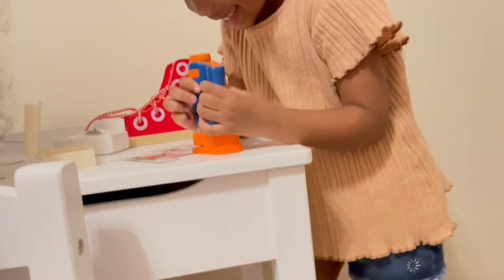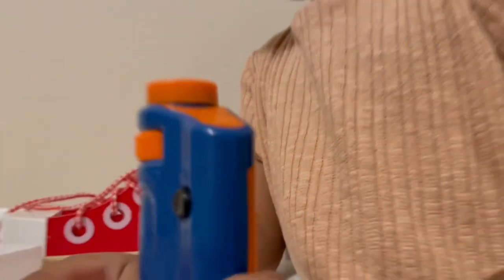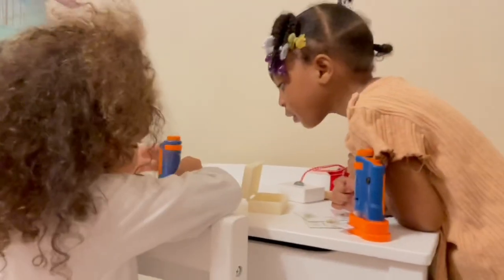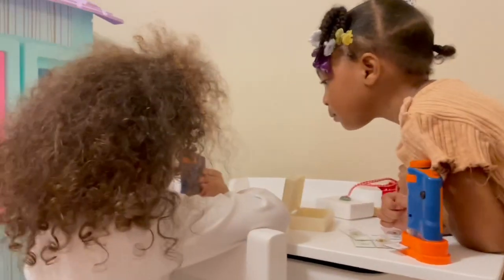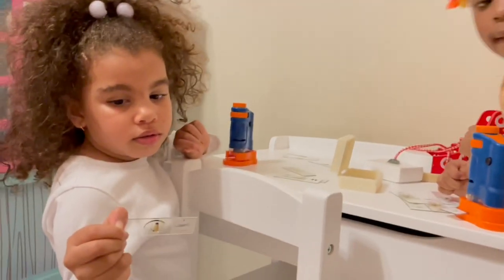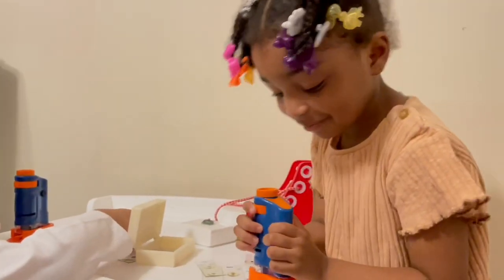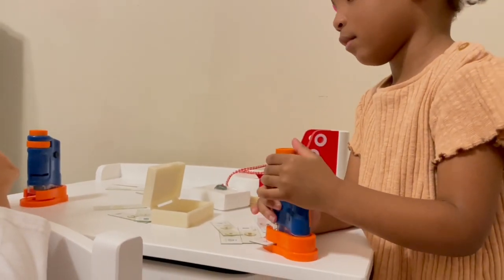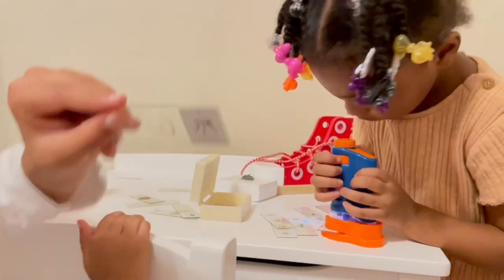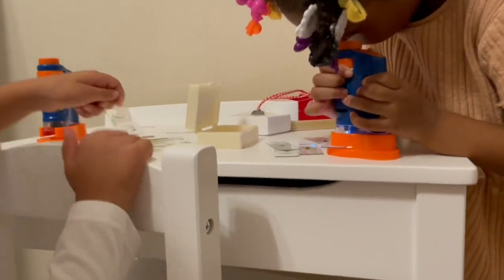London, what do you see? What are you looking at? It's a housefly mouth part. Look at mine. This is the bug's leg, right? Yeah. But the bug is right there — did you get a closer look at it? Let me see. It's a bug leg. I'm going to look at this one. What is this one? It's a mosquito antenna. Look at how small that is on there.